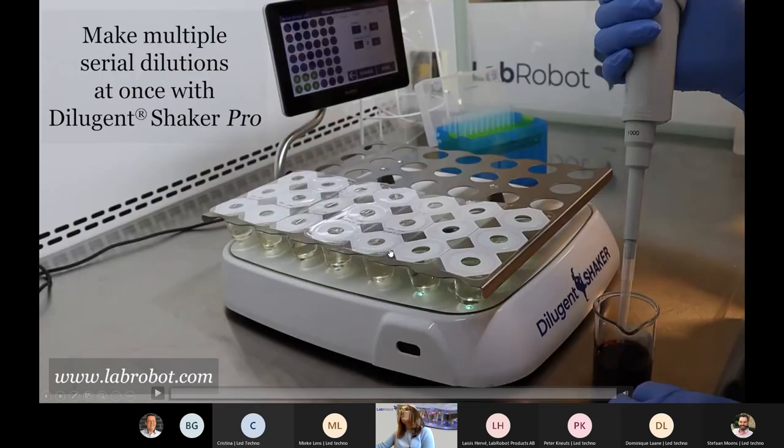With Dilugent Shaker Pro, you can also do parallel working at the same time, which is a great benefit for saving time in general.